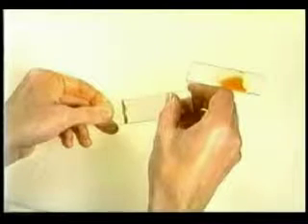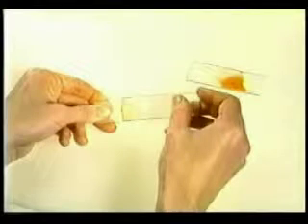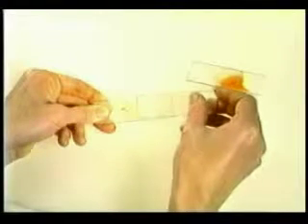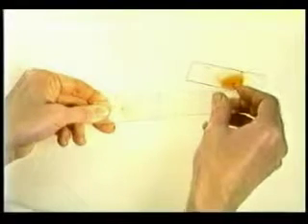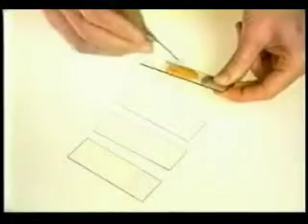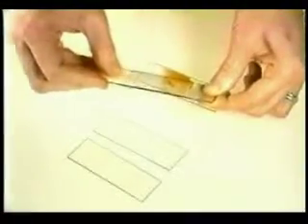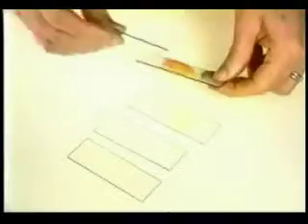Rotate the top slide until it rests flat on the bottom slide, and then smear, taking care to keep the slides parallel to avoid scraping the harvested cells. The finished smear consists of tissue fragments smeared out in a thin film of fluid that will not interfere with the interpretation. The concentration and smearing may be repeated several times from a single slide.